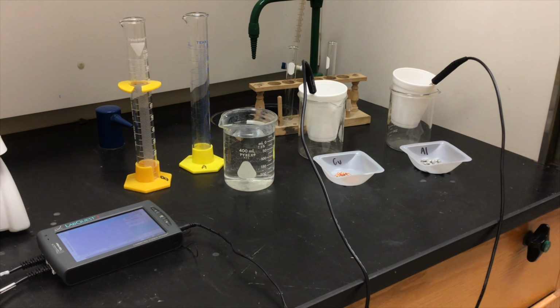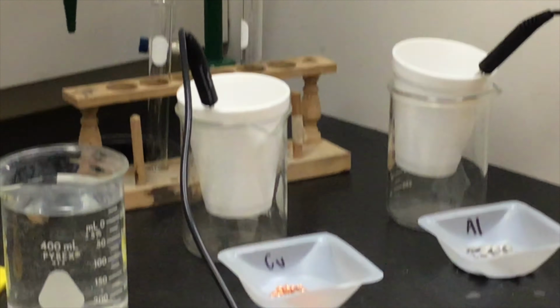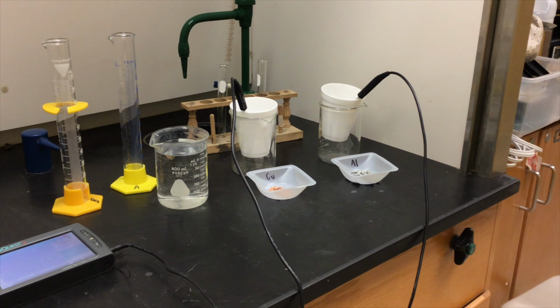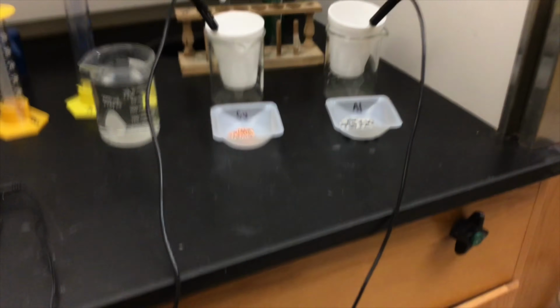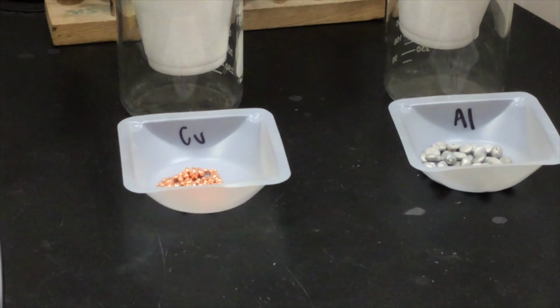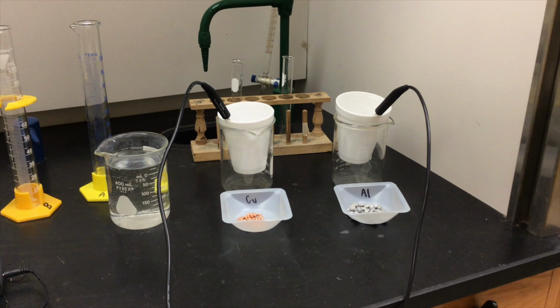We have two beakers set up over here, simply styrofoam cups sitting inside a beaker so they don't fall over. And inside those we have temperature probes. And then over here we have two containers. Okay, one has copper, one has aluminum. They are labeled. They have both been measured out with 20 grams each. And then in the back we have two test tubes waiting for them. So that is our setup.